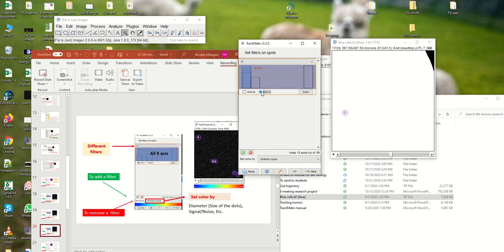If I place below, now it's labeling this, but it's not labeling this. Let's add these two dots and until here, and all of them that are here will disappear. If I do the opposite, look, now it's labeling this one, not this one. So just go below, and now it's perfect.